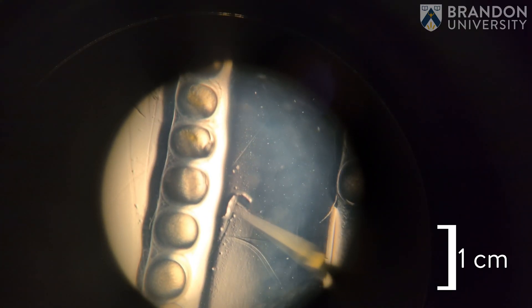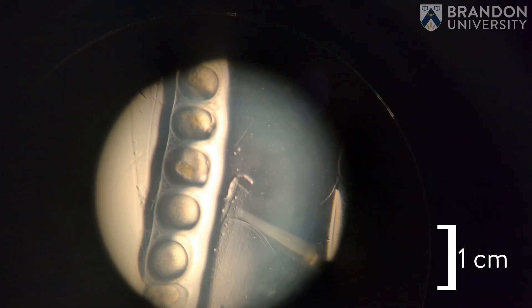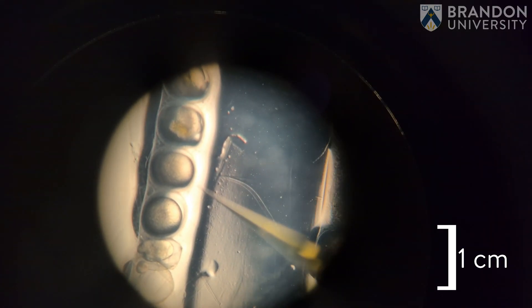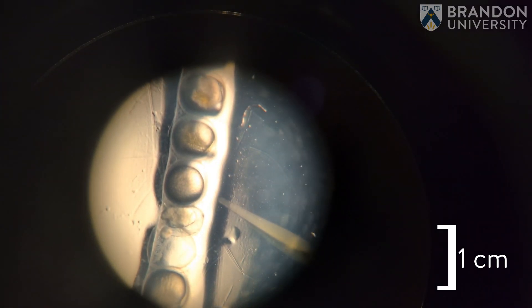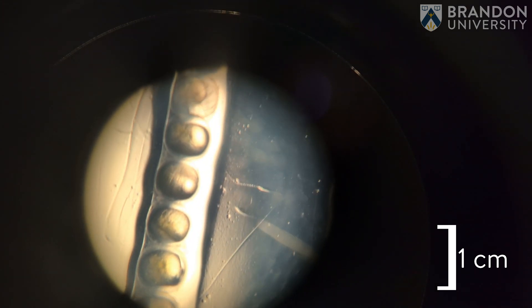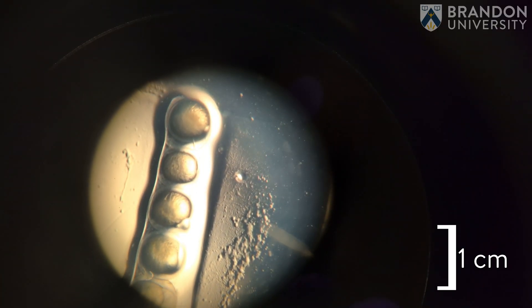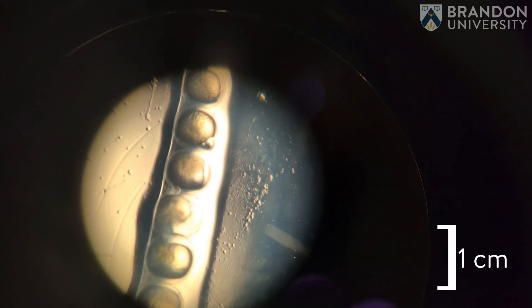The embryos have a chorion, which is that clear structure you see here, and the more gray structure is called the yolk — all of their nutrients for the next five days of their life. You can note that in some embryos cells are starting to develop along the yolk, but they're still in very early stages — the one to four cell stage — which is when we need to do these micro injections so that the morpholino that knocks down genes can be taken up into every single cell that develops.